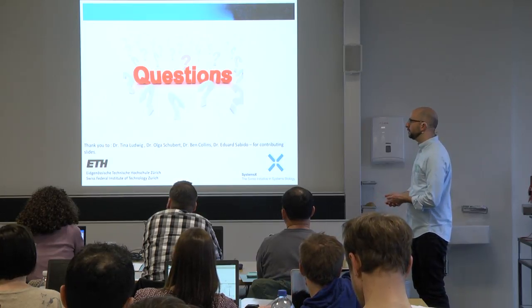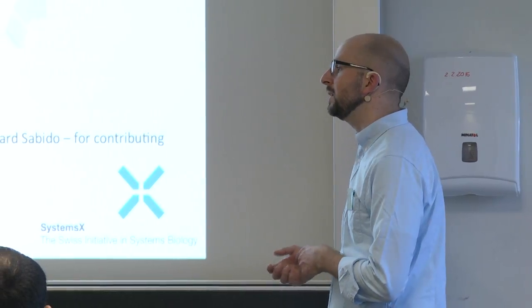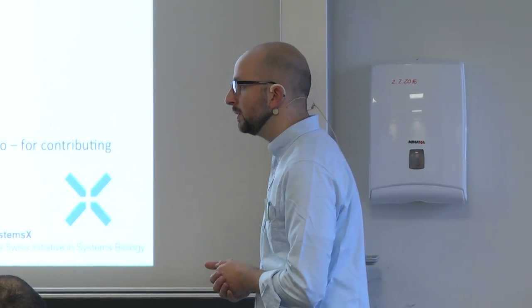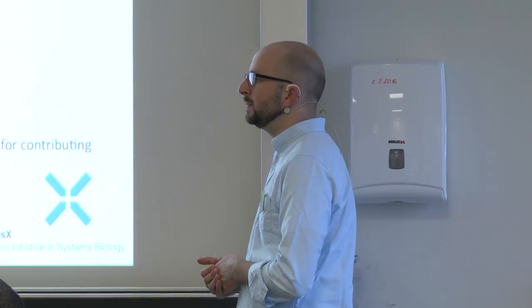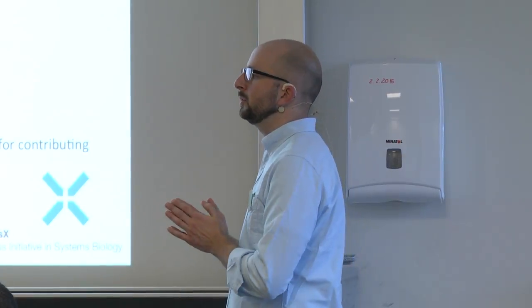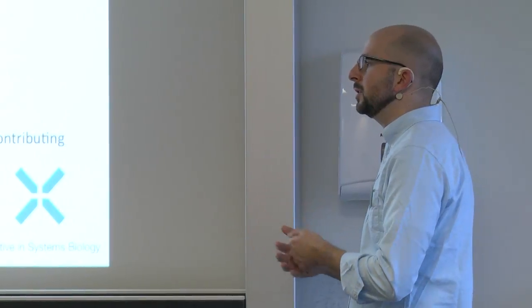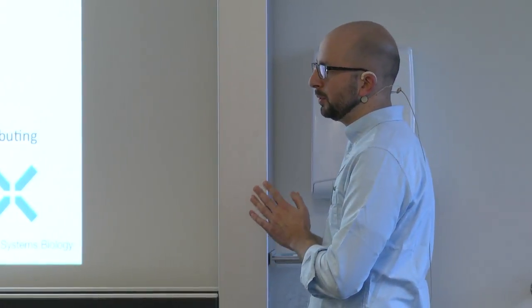It would be very hard for me to answer this question. If Y4 is from a very small peptide, it's a very different Y4 from a peptide that is 35 amino acids long. So in terms of selectivity, this relates to the length and sequence of the peptide. If Y4 is just R, or there, it's very hard to make a statement about one type of ion. We can say that the shorter the ion, the smaller the ion, so a lower M over Z, there's more likelihood that there are more types of peptides that would lead to such an ion. But that should not exclude it for the purposes of quantification.